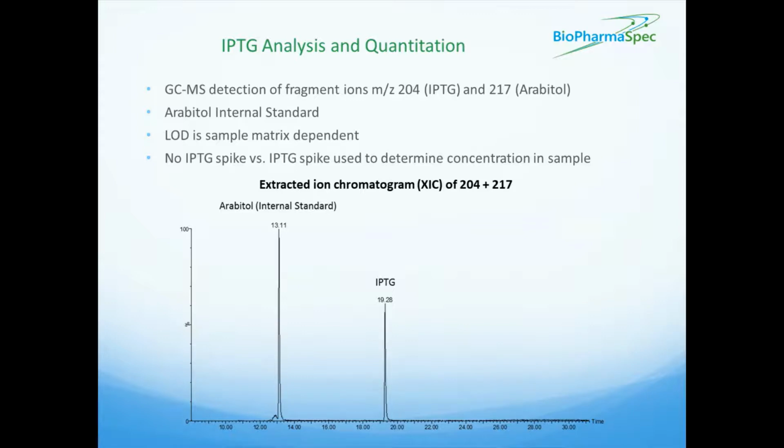Now, before we move on to the next assay, I want to talk a little bit about this second peak that you can see on the chromatogram here.